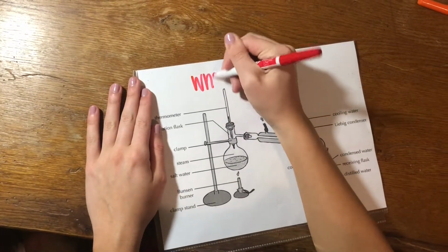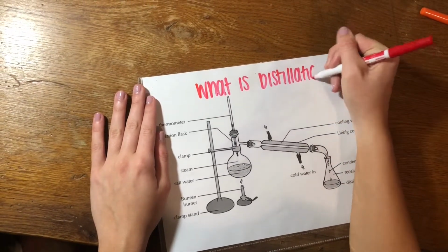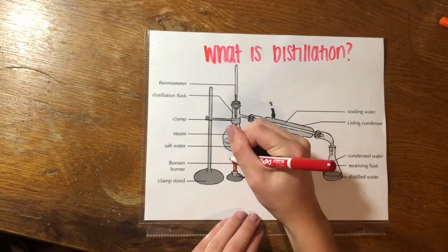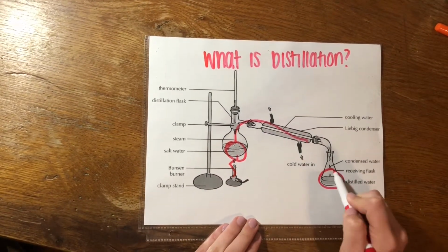So, what is distillation? Distillation is the technique of heating a liquid to create vapor, which is collected when cooled.